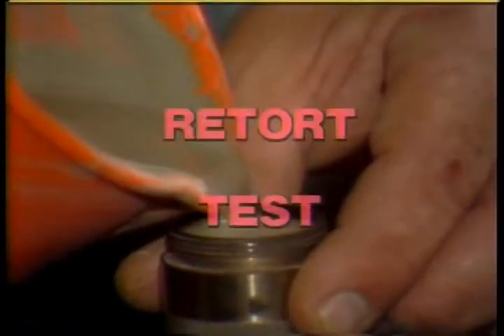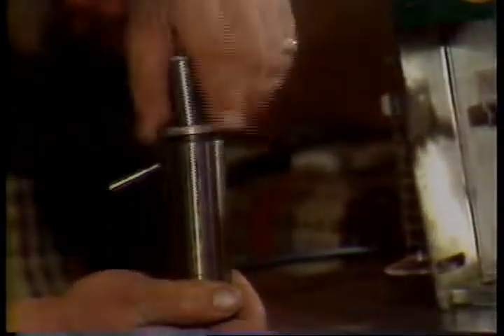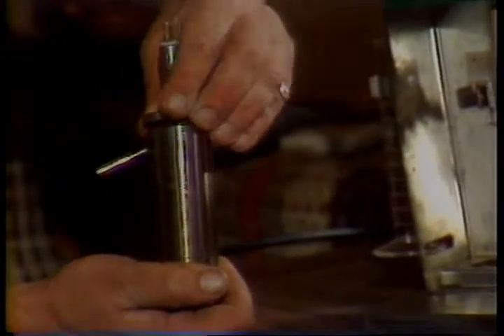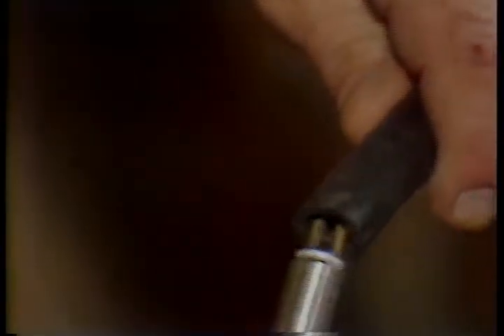Finally, the mud engineer might run a retort test to determine oil to water content and solids concentration of the mud. We're going to put approximately 20 cc's of mud into this cylinder. What this test does, essentially, is to take a sample of mud and boil off the liquids. This is one test that should be run daily. Now we'll plug it into our power source. Put it into the unit.